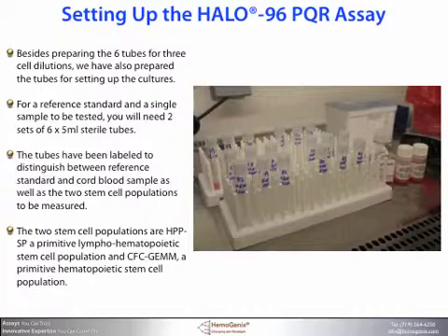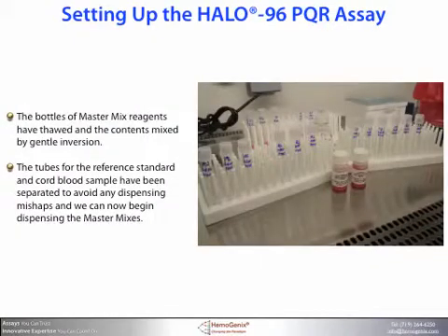The tubes have been labeled to distinguish between the reference standard and the cord blood sample, as well as the two stem cell populations to be measured. The two stem cell populations are HPP-SP, which is a primitive lymphohematopoietic stem cell population, and the CFC-GEMM, which is a primitive hematopoietic stem cell population. The bottles of master mix reagents have been thawed and the contents mixed gently by inversion. The tubes for the reference standard and cord blood sample have been separated to avoid any dispensing mishaps, and we can now begin dispensing the different master mixes.